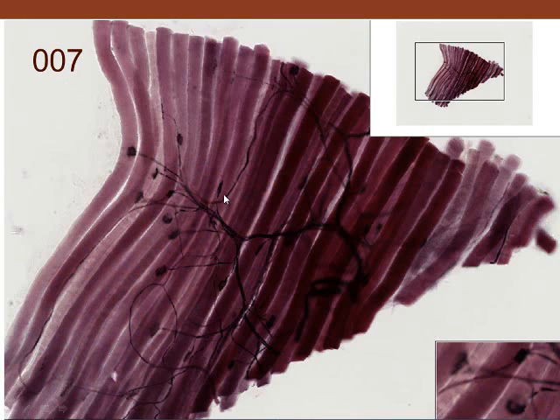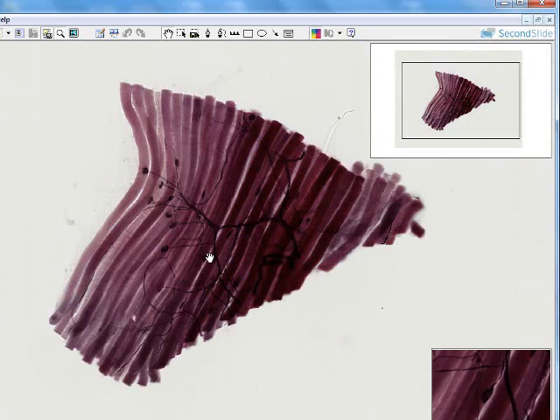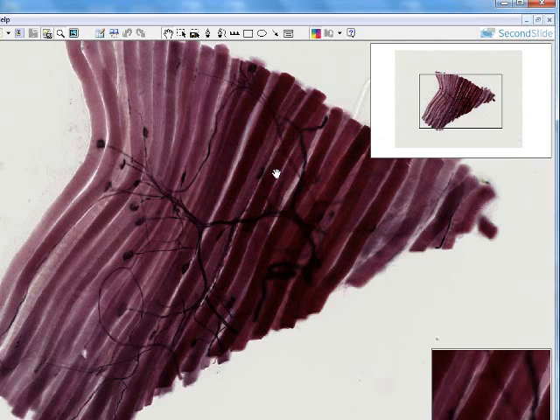So we see those. You can see the axons coming through there and there and there and there, and these would be the motor end plates on these individual fibers that are in here. So these are muscle fibers as a cell that we see there. And here we can see these are skeletal muscle fibers.